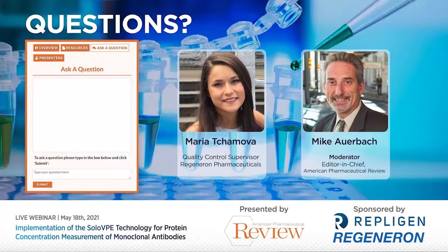Is it possible to measure sample turbidity with SoloVPE? I could take this one. This is Joe Ferriolo from Repligen. The work has not yet been explored for that application, so it's not a no. We just haven't put the time in for that.